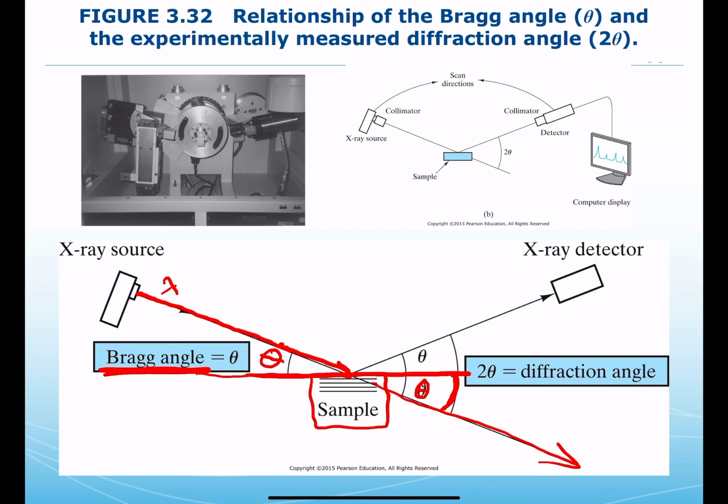Okay, and so the architecture of instruments is often to place a detector for monitoring for constructive and destructive interference as beams are reflected out of the sample, is to position that at the same angle, at the Bragg angle. So here you see the detector from the plane of the sample, it has been moved to an angle theta up away from the plane of the surface.